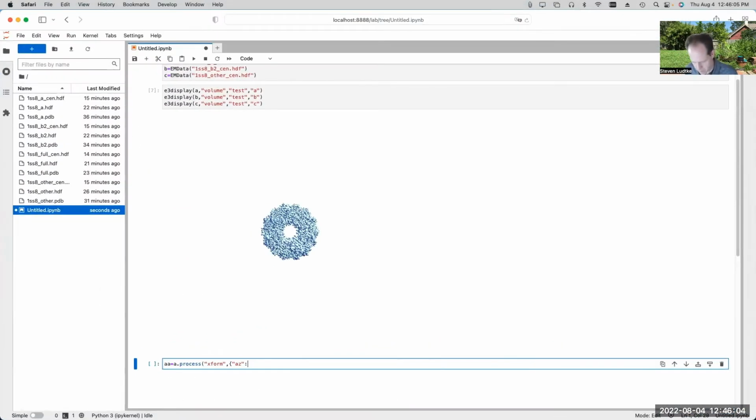Plus 27.5 altitude, and we'll go ahead and just do a test first. We'll make it say 15 degrees, and then phi minus 27.5.